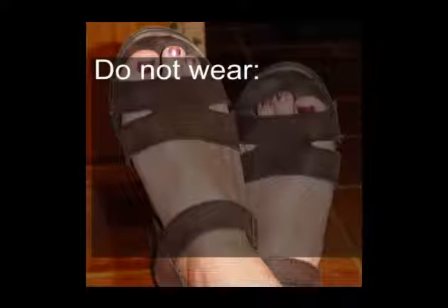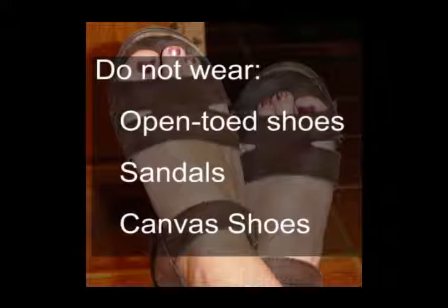Do not wear open-toed shoes, sandals, or canvas shoes in the laboratory classroom.